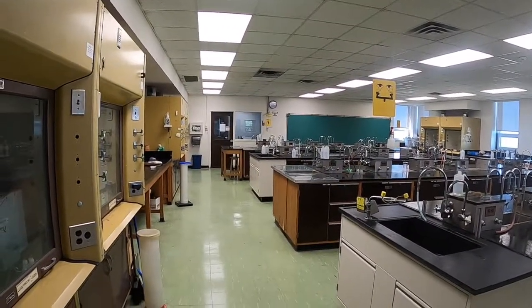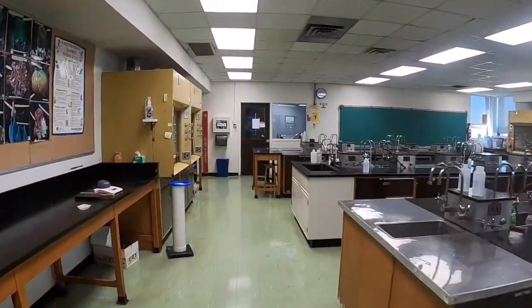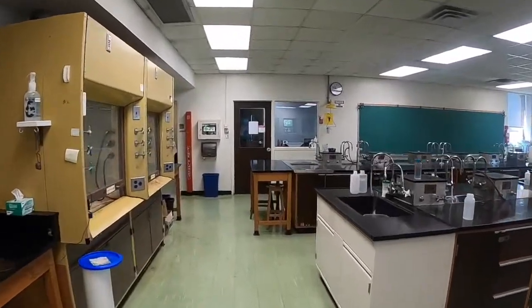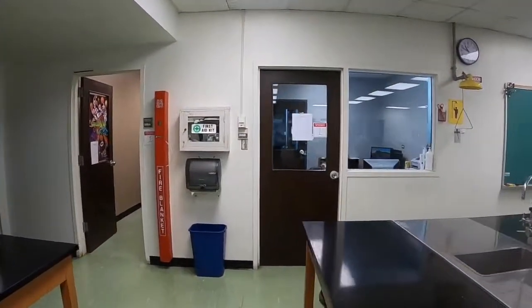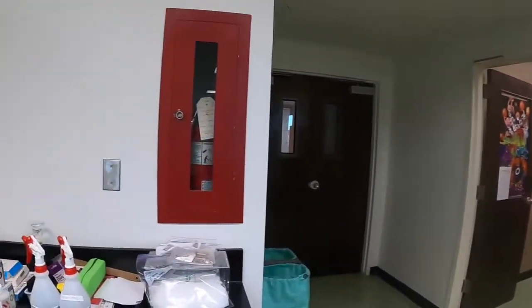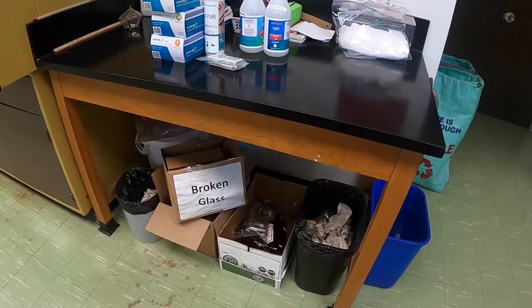Sometimes in the lab, you might drop a piece of glassware and break it. In the event that you do, we can't throw broken glass into the garbage where it might accidentally injure a cleaner, so we have to dispose of our sharps separately. We have a box at the front of the room labeled 'broken glass,' and that's where you should dispose of any broken glassware.